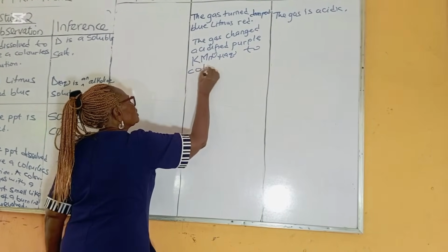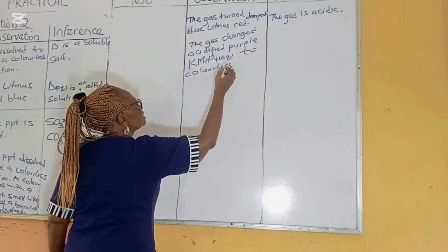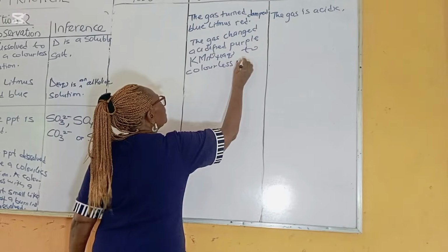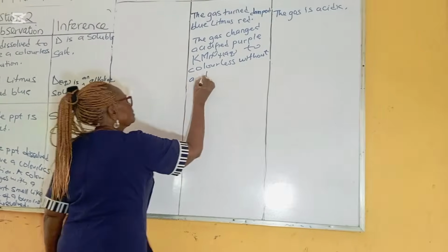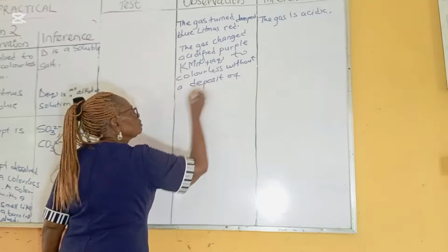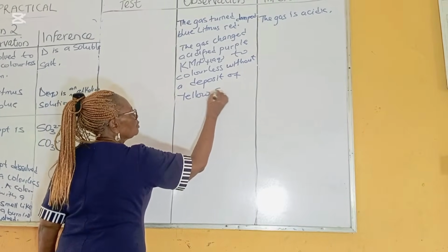This is a confirmatory test for this gas. I'm about to tell you what it is. Good. Or you can complete it without a deposit of yellow sulfur.